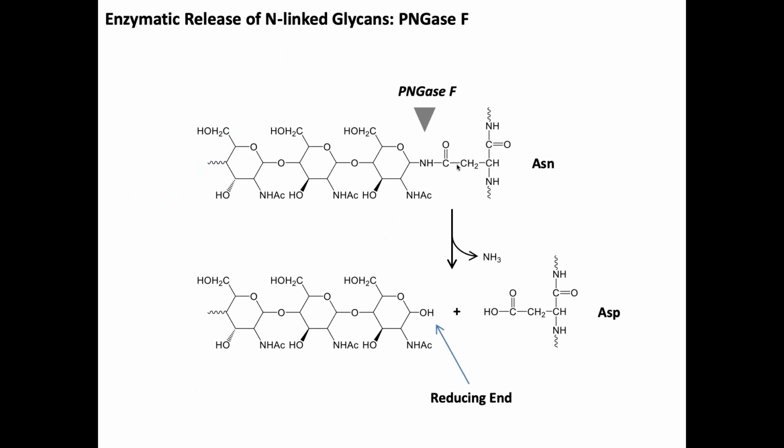But there's the other aspect, where you could do Endo H and leave a little bit more of a monosaccharide residue, which may give you a more distinct signature, if you will, that this was definitely N-linked glycosylated. I don't know the answer, but what's the cost of Endo H versus PNGase F? What's the efficiency? Are there exceptions? Does Endo H have exceptions where it doesn't cleave high mannose as well as hybrid? These kinds of biases can be present, and I just don't know off the top of my head, but they are something to consider for sure.